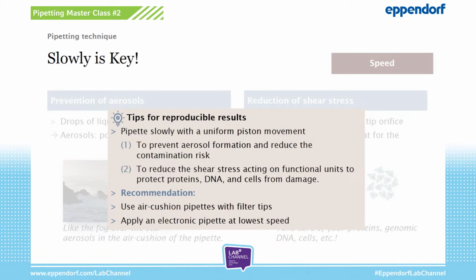Filter tips protect very well against aerosols and should be considered when using air cushion pipettes. And also an electronic pipette can guarantee slow and very smooth pipetting steps because I have defined piston movements.